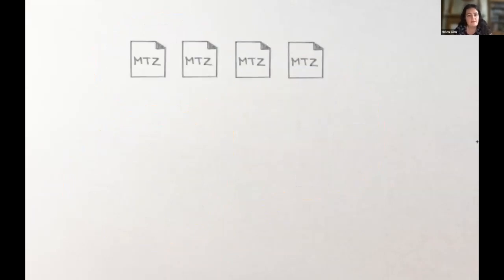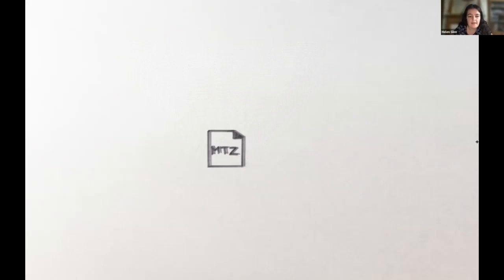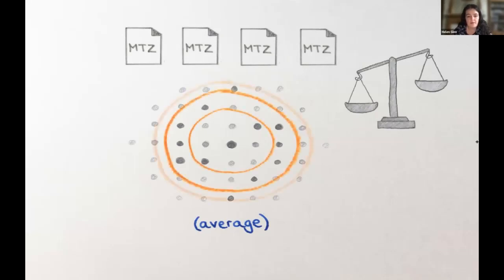So what Cluster4X does is to take a number of reflection lists and firstly merge them into a set of average reflections. We can then go back to the original data sets and scale the individual data sets in resolution bins in order to bring all of the data sets onto a basic isomorphous similarity of the B factor.